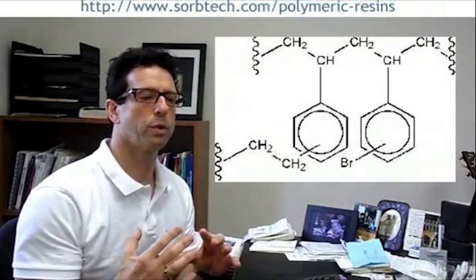Polymeric resins, and we haven't really talked about that. Ion exchange resins are another way for you to create good separation that you may not have luck with on silica. The advantage with ion exchange resins is that they offer high pH stability, and what's also great about ion exchange resins is if you're creating a scale-up procedure, they are easy to clean and they're reusable. With typical silica-based resins, especially silica, it's typically a 1 or 2 load and you're done. C18, you can condition it, but even after a while, you get irreversible binding. But with polymeric resins, you can clean them, reuse them, and for scale-up, and again, if you're looking at method development, that the process is going larger, it's a great way to play.